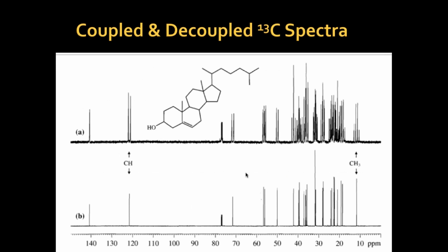As you can see here, just an example I'm giving you for the C13 spectrum. Don't see the upper one, see the lower one. This is the C13 spectrum of this molecule. You can see that the range is very high. It's not from 0 to 14. It goes into the hundreds, and you can see which carbon belongs where.